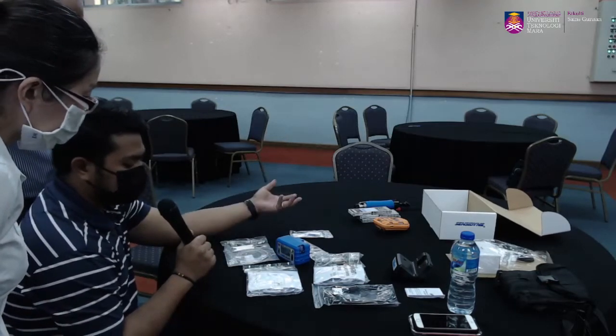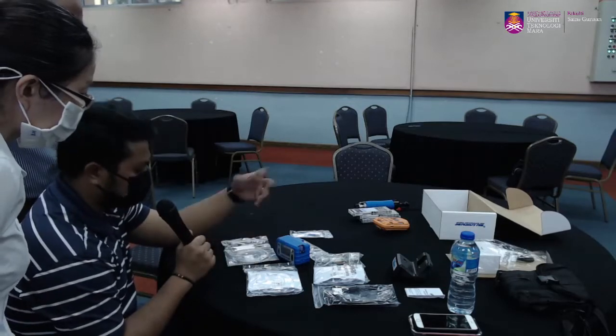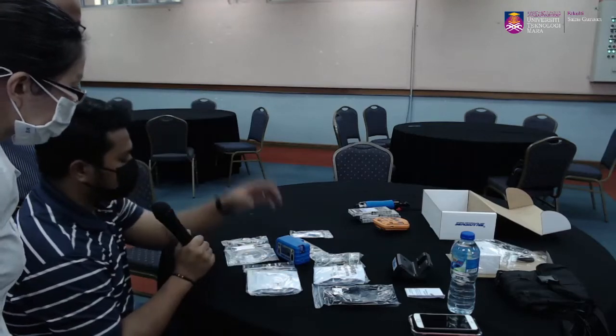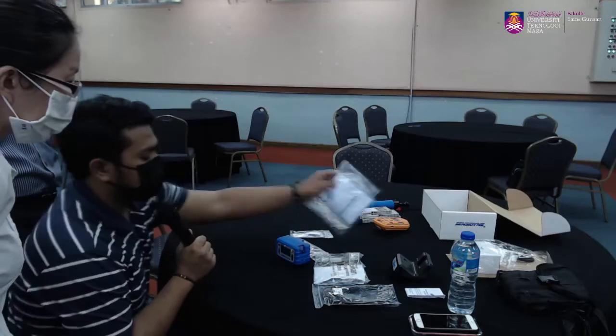Depending on what cassette we use, all can be used. So far, the size fits correctly. So if we use a cassette, we use this kit. If we use a sorbent tube, we use this kit. Alright.